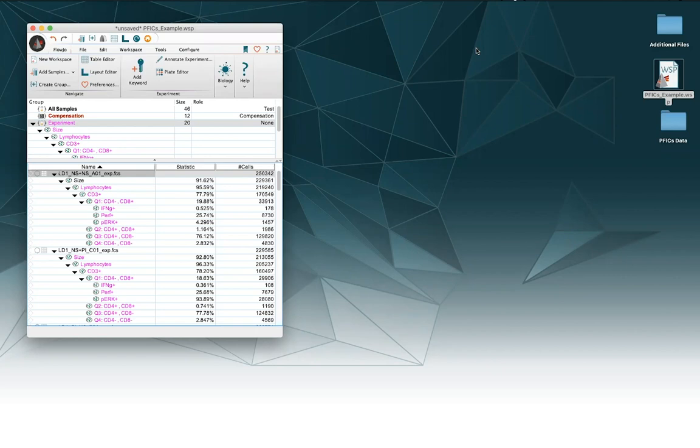Normally the stain name is decided when we're acquiring data with the acquisition software on our cytometer and we can choose the name for our stains then and set it and write it to the FCS file. But sometimes we get to FlowJo and we're looking at the data and realize that something's wrong with the stain name here.